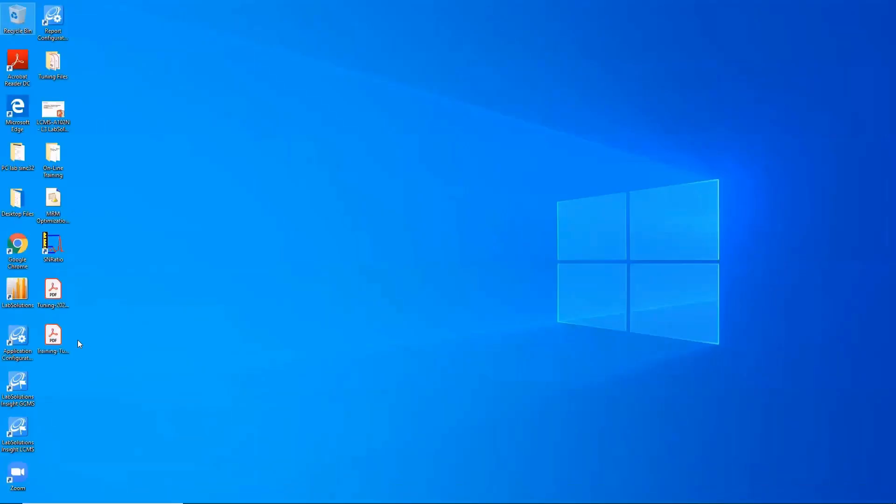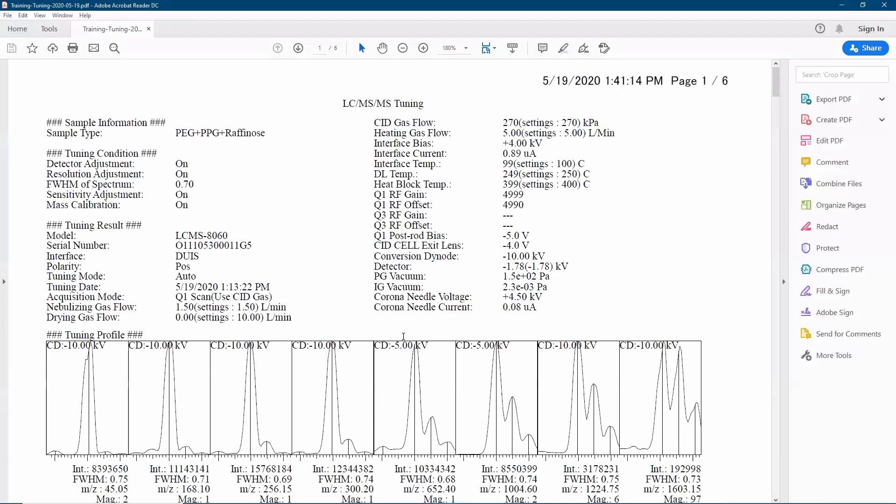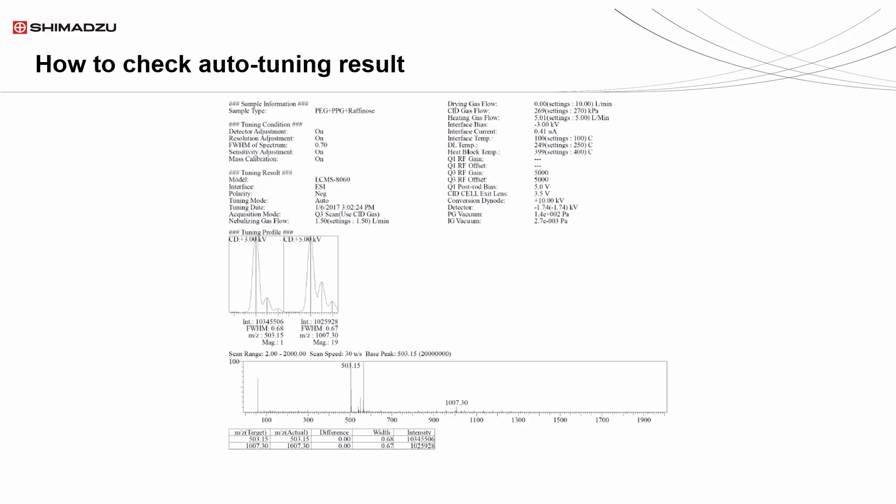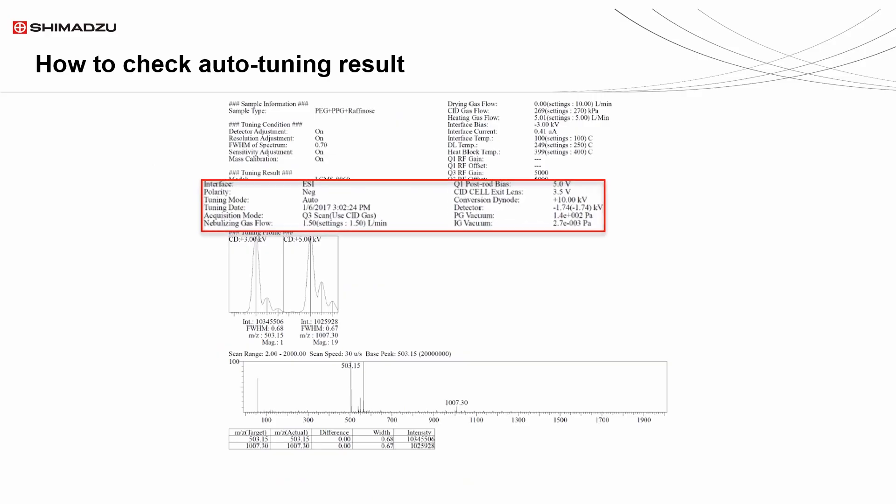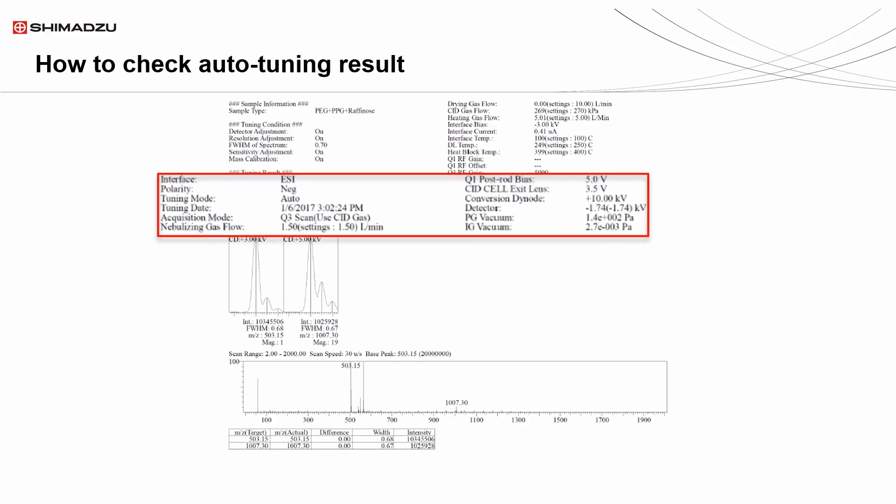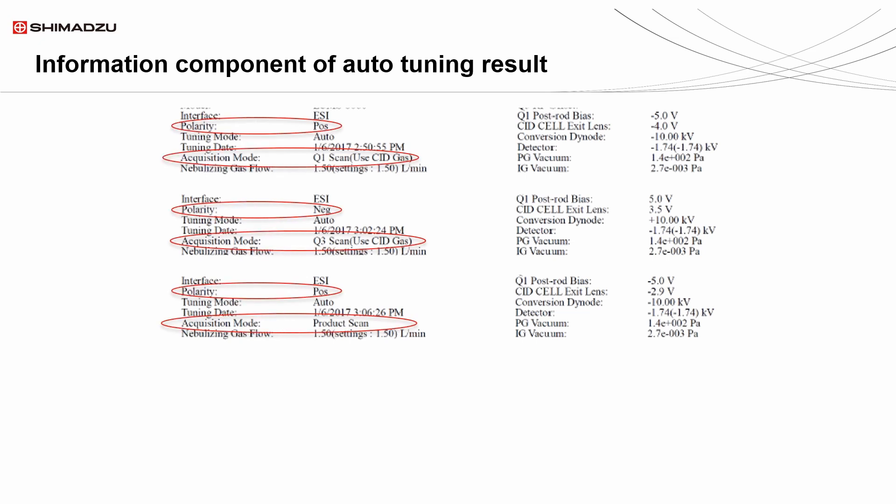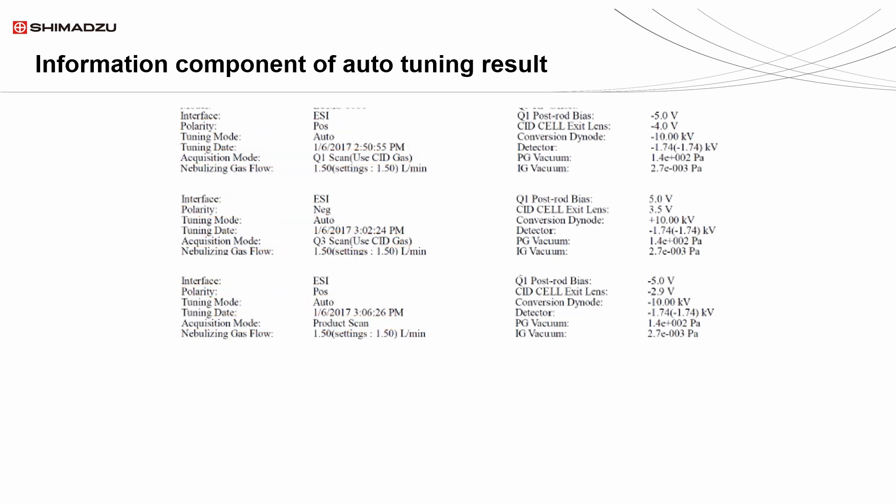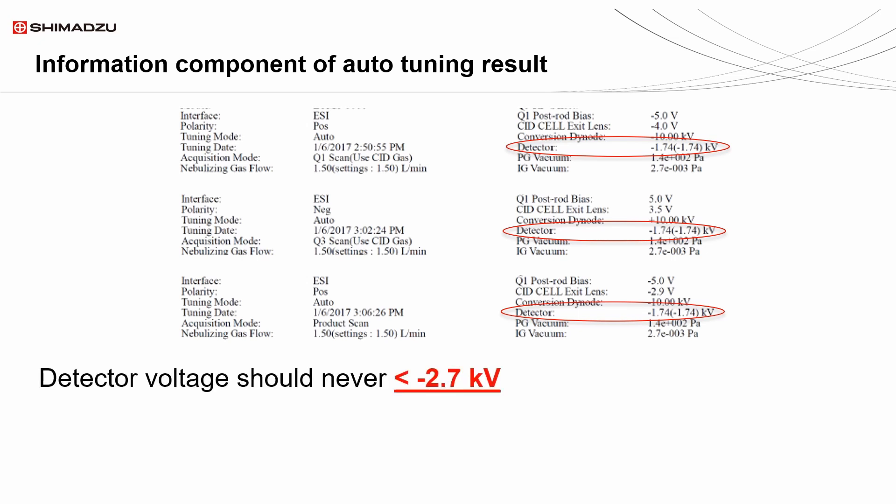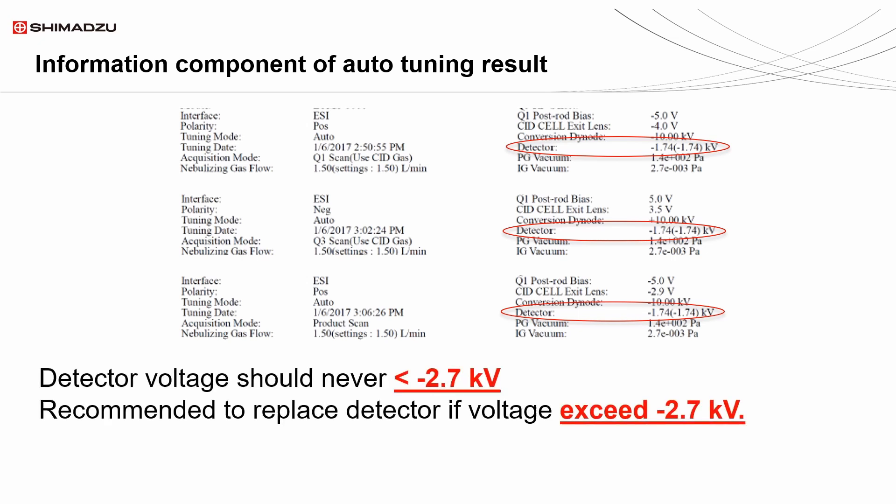To check auto-tuning result, first look at the information part of it. In here you can find the tuning result scan type and scan mode. Check the detector parameter for detector voltage. Detector voltage should never exceed negative 2.7 kilovolt. It is recommended to replace the detector if the voltage exceeds negative 2.7 kilovolt.